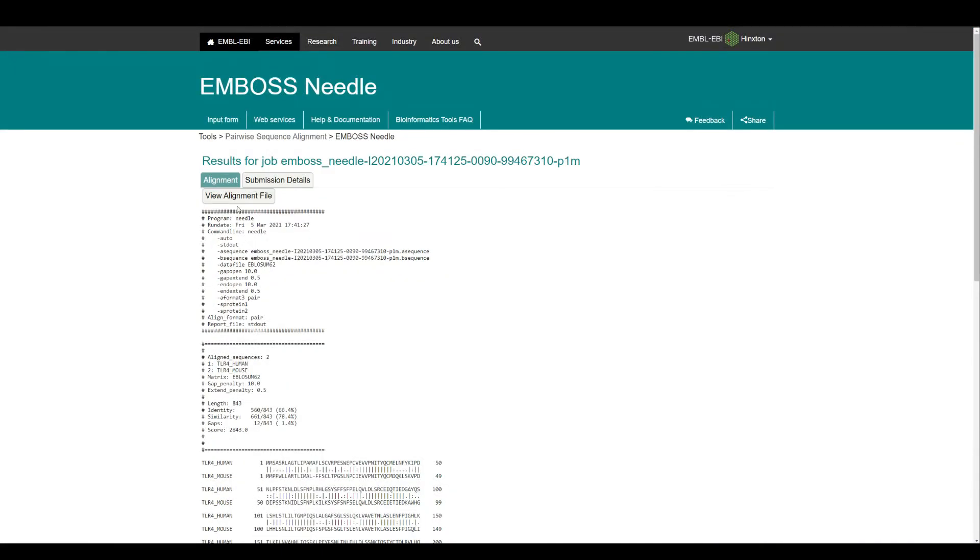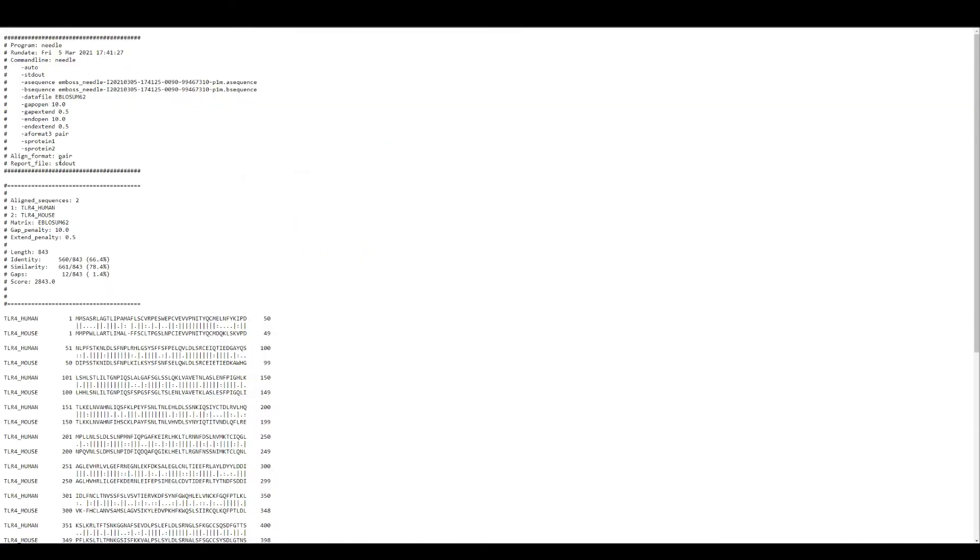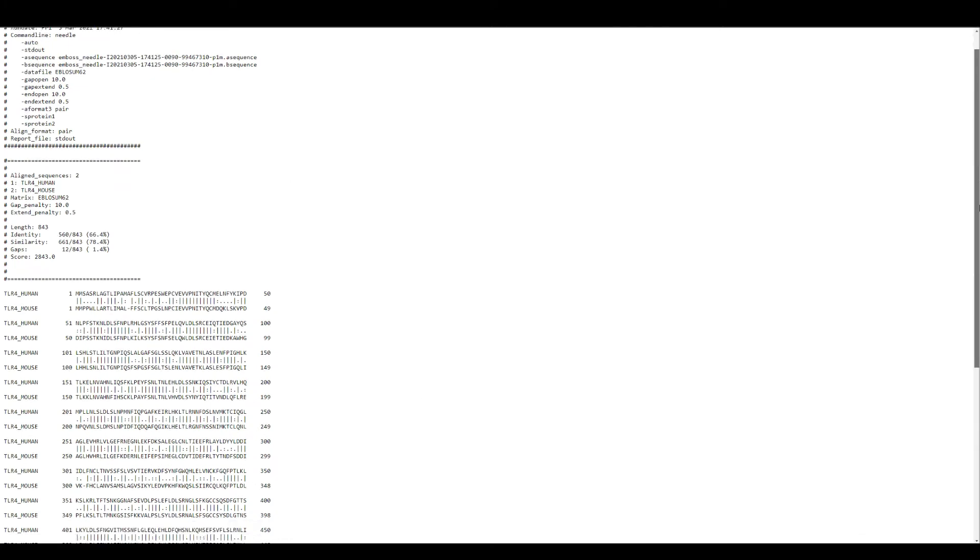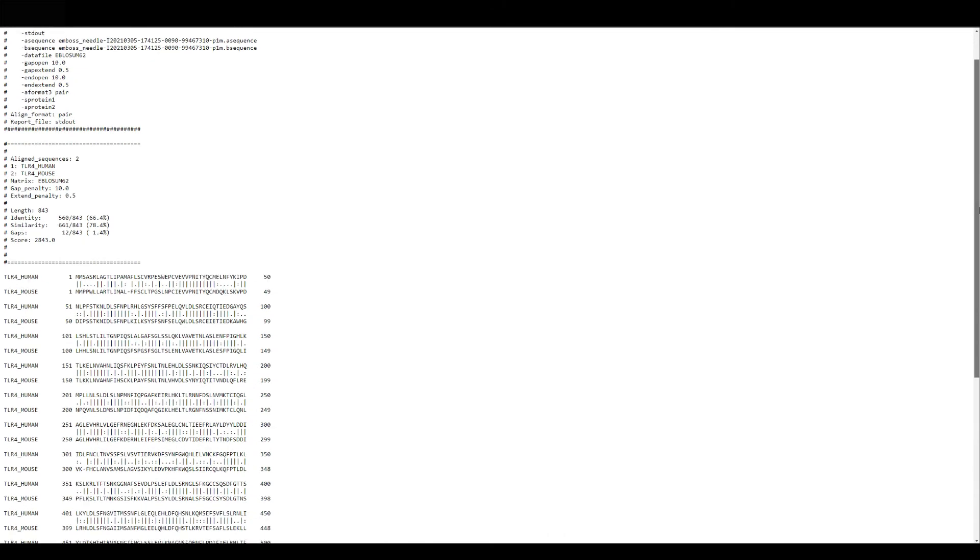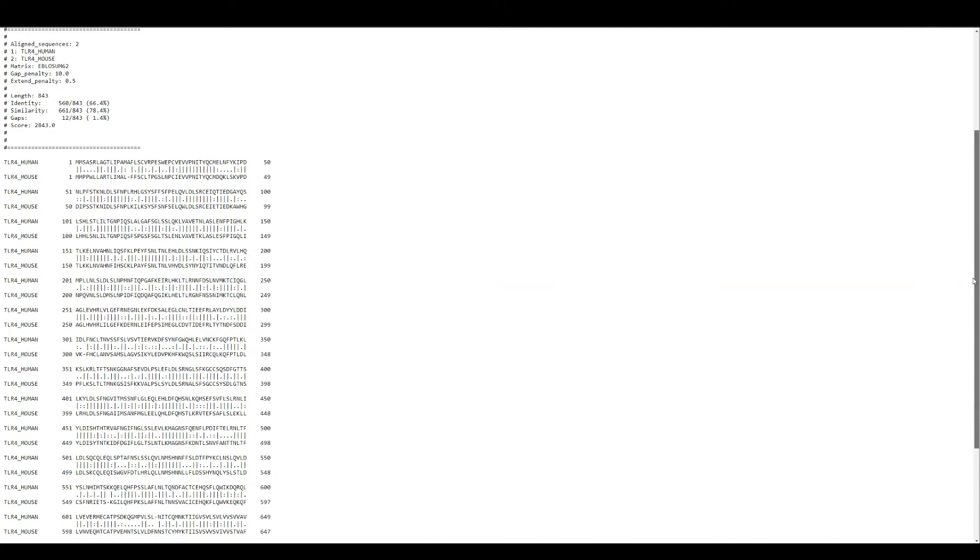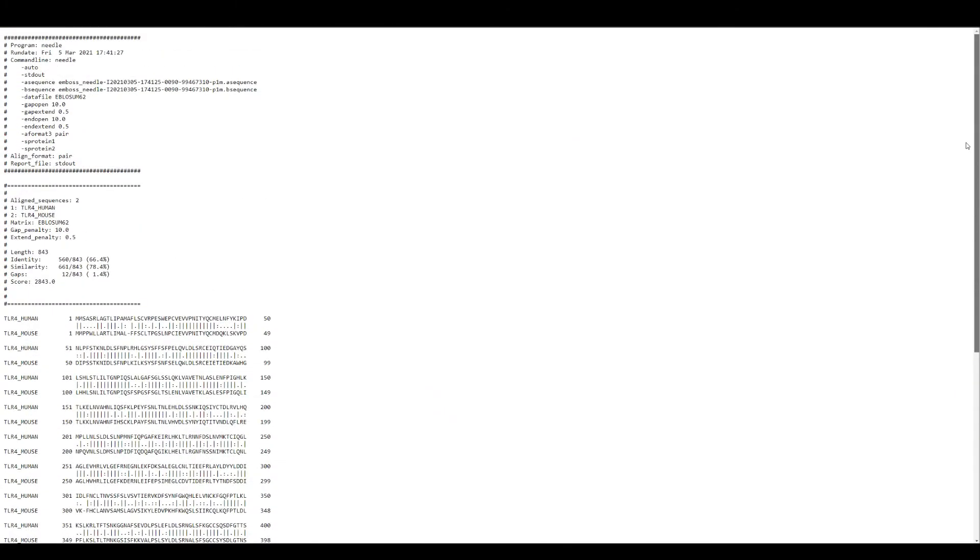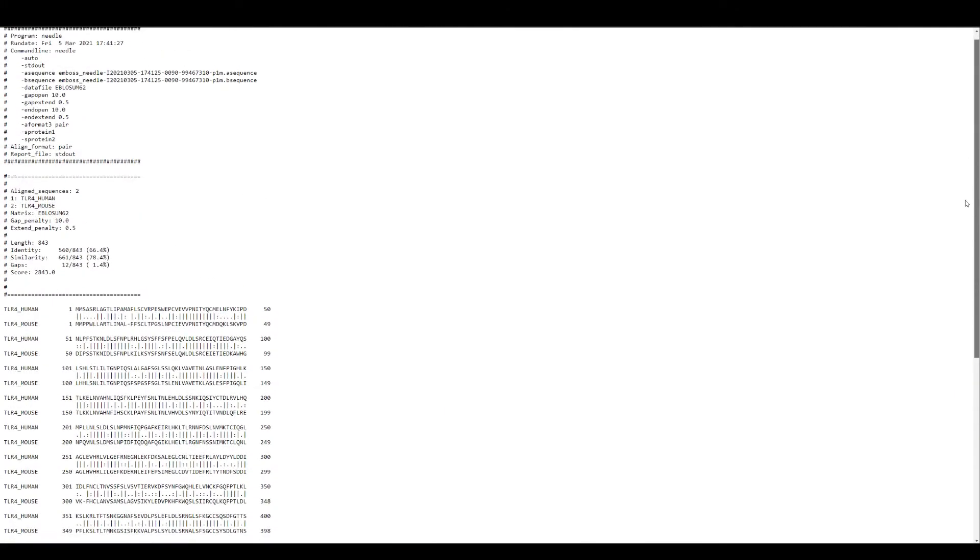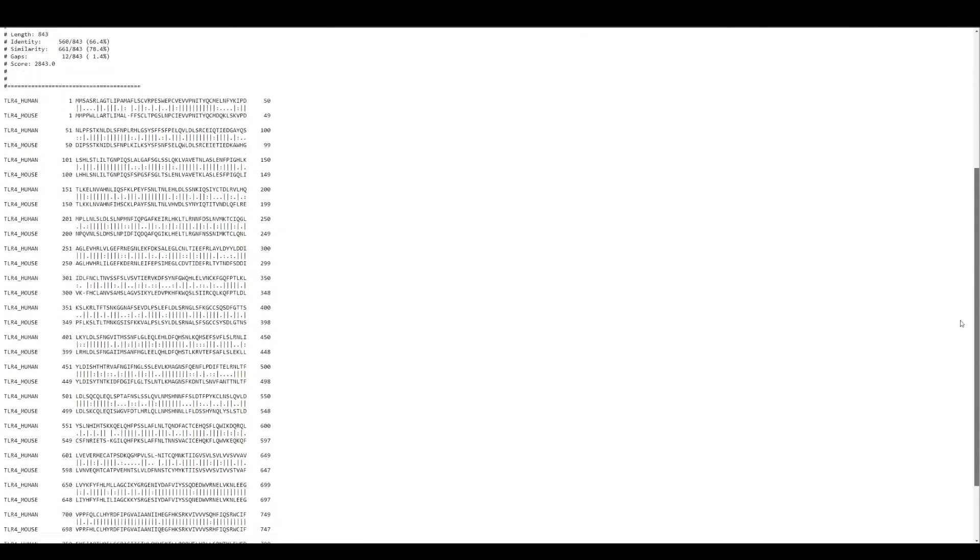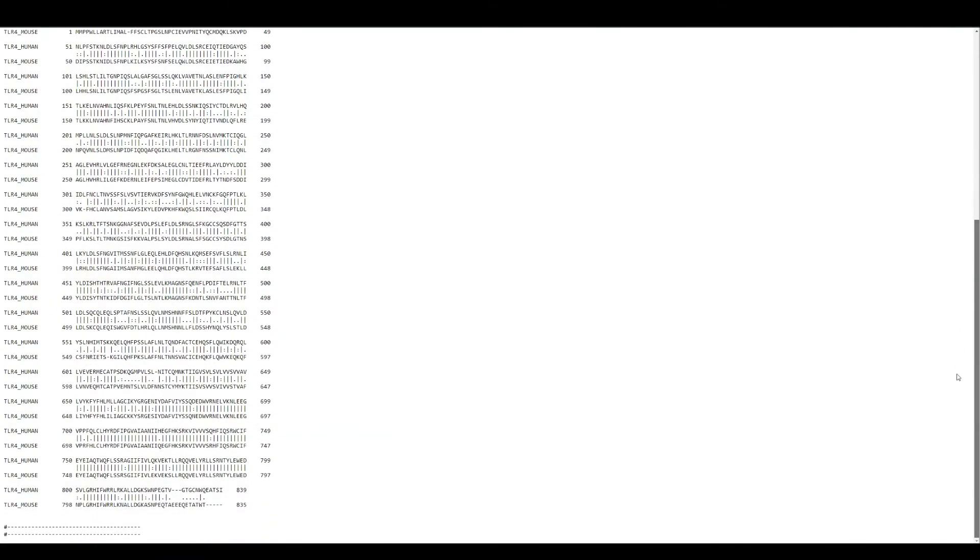You can also get this alignment file. If I click on view alignment file, you can get this and copy this and make your own text file. These lines indicate that you have the same amino acid in both of the sequences. When you have a line, the whole stretch of the amino acid sequence is the same.